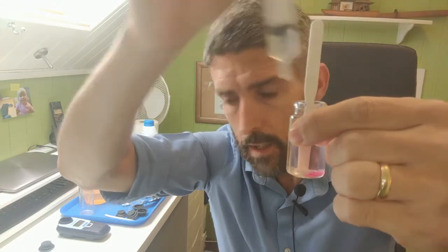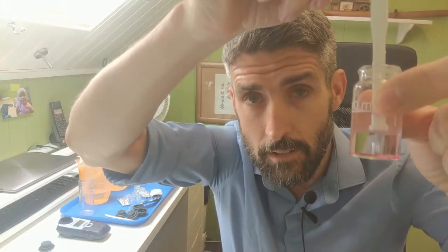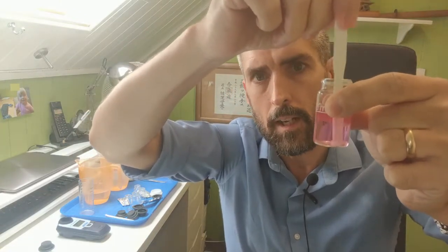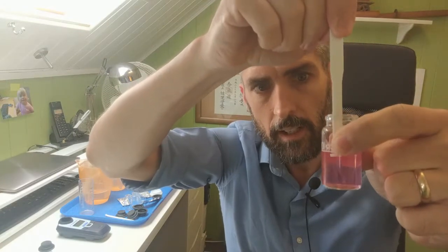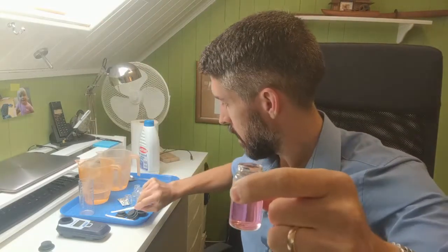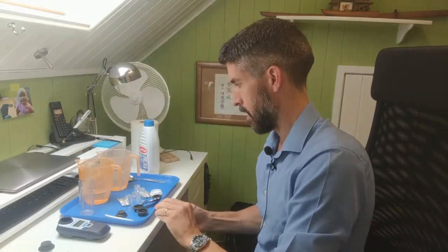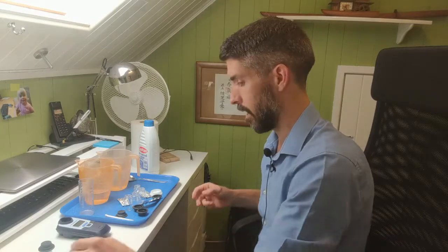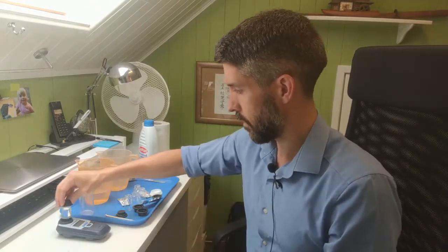What you'll see is that it's gone clear - a tiny bit of pink has remained but it's gone very very clear, very much lighter. Something's not right there. If we put that in the photometer, it would probably be quite a low reading that we'd get back. So let's put the blank in the photometer so we can zero it.